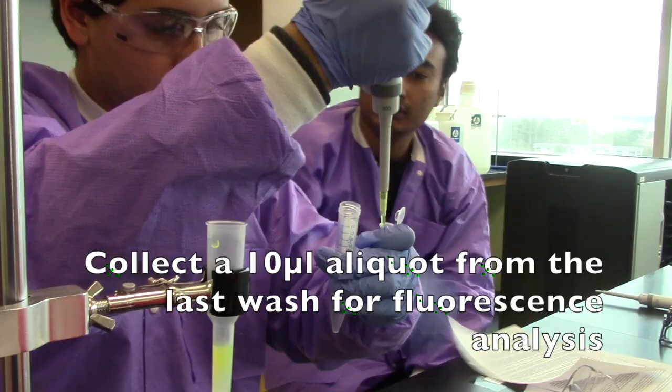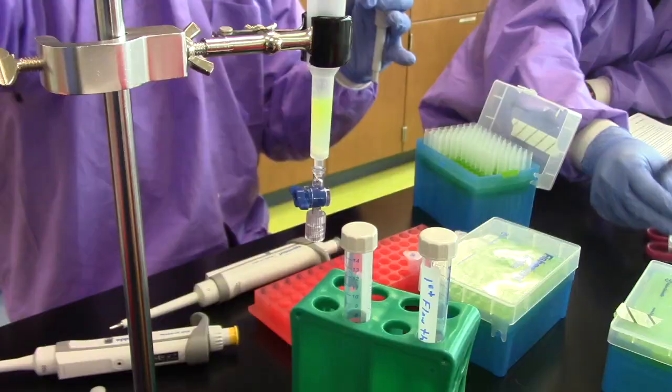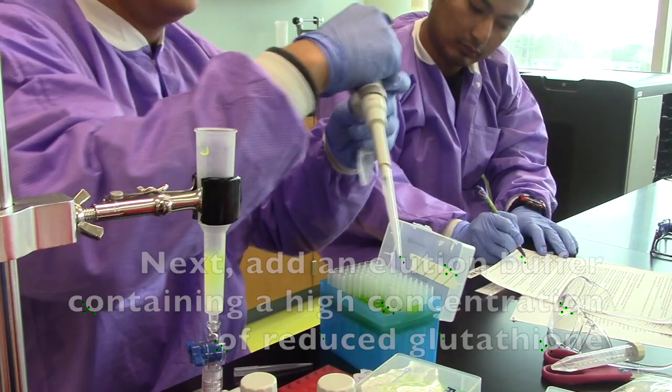Next, add an elution buffer containing a high concentration of reduced glutathione. This enables you to compete for binding with GST Campari on the glutathione resin. This will cause GST Campari to dissociate from the column and flow through.